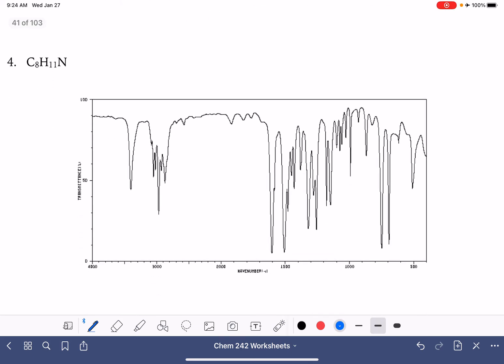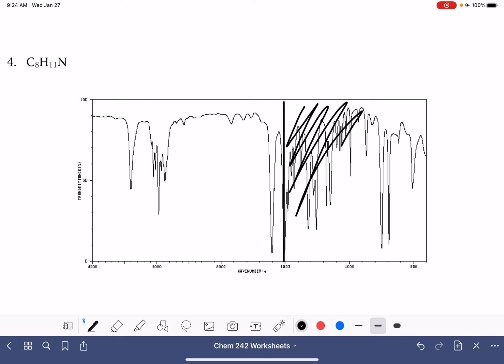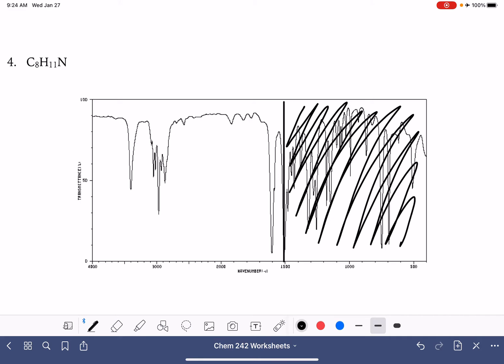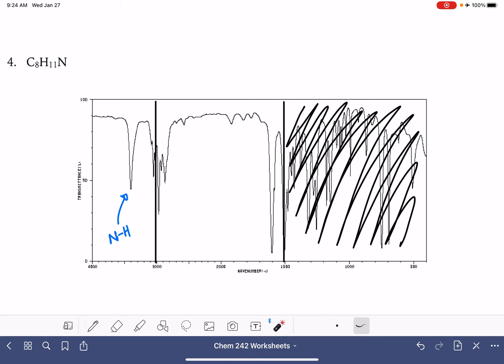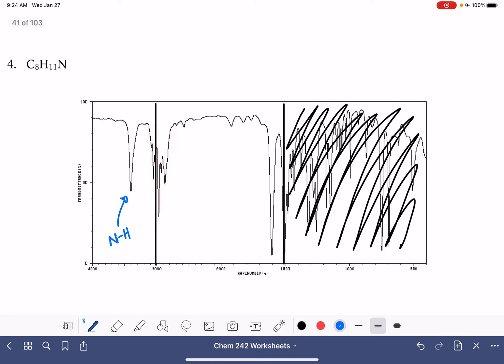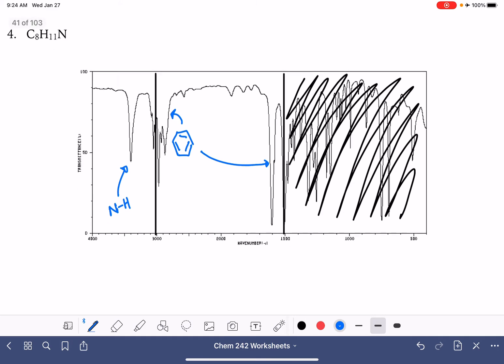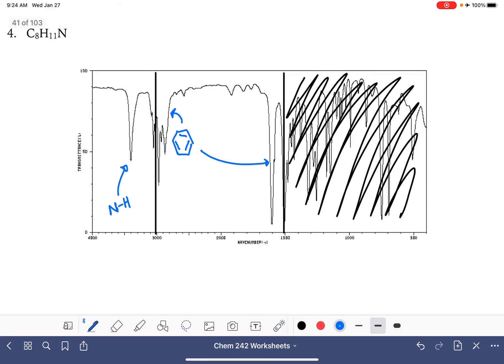Here's our next example: C8H11N. Since I know I have a nitrogen in the molecule, I need to be looking for the NH peaks. It looks like I have one NH peak, which means my molecule just has one NH bond. This funny-looking carbon-hydrogen area tells me there's a benzene ring, and the benzene ring has carbon-carbon double bonds — there are those two peaks. That's all I'm seeing in terms of functional groups.